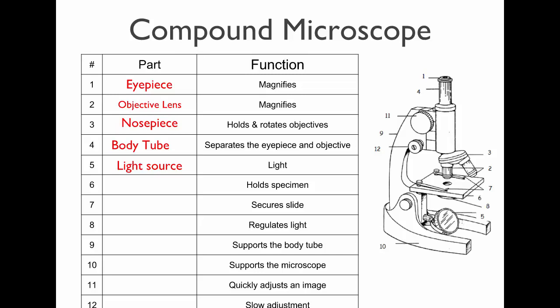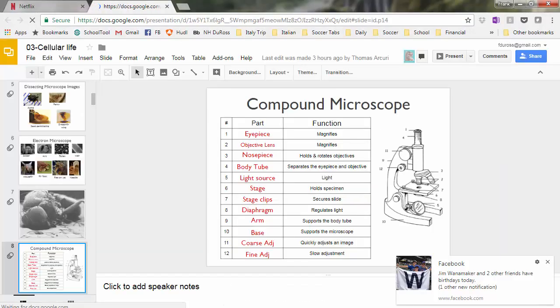This part where you put your specimen that you're going to be viewing, it's on display, that's called the stage. Makes sense, right? Oops, sorry. So that's the stage.